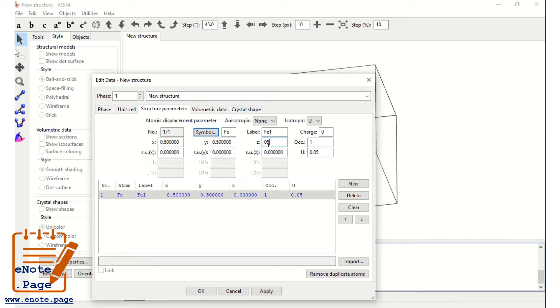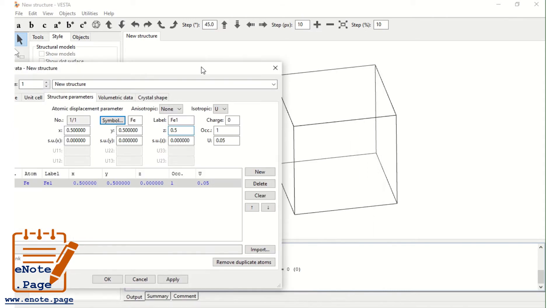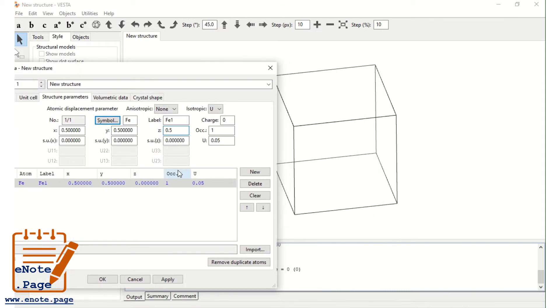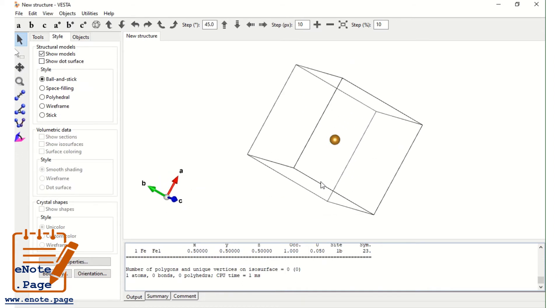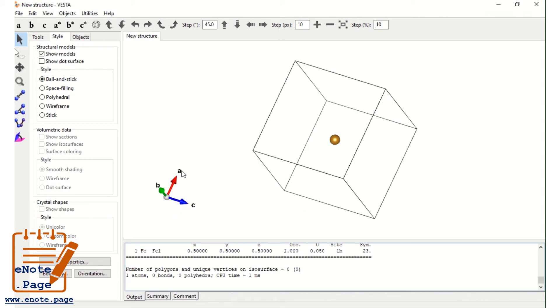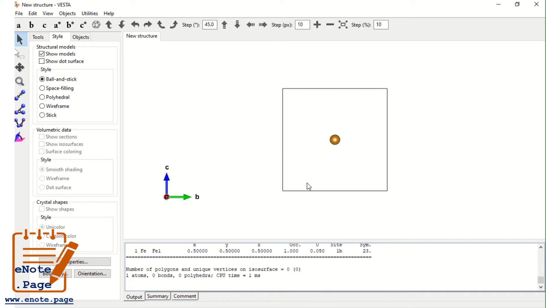What this means? The atom is located half from the origin along the x-axis, along the y-axis, and along the z-axis. So the total is 10 angstrom along x, y, z. We are taking the fractional coordinates as 0.5, 0.5, 0.5. Now apply. The atom is placed exactly at 5 angstrom along the x-axis and 5 angstrom along the y-axis.